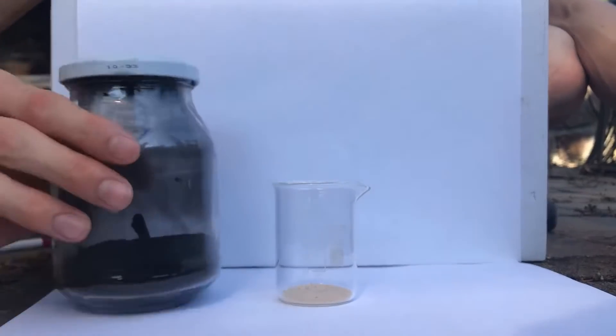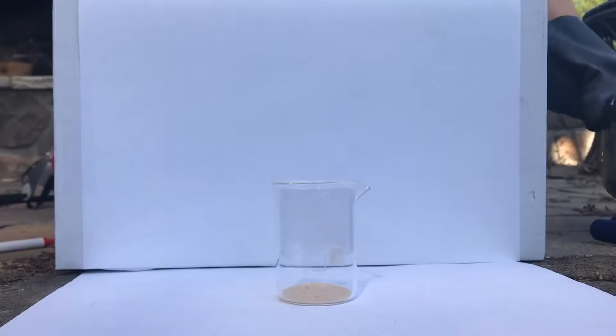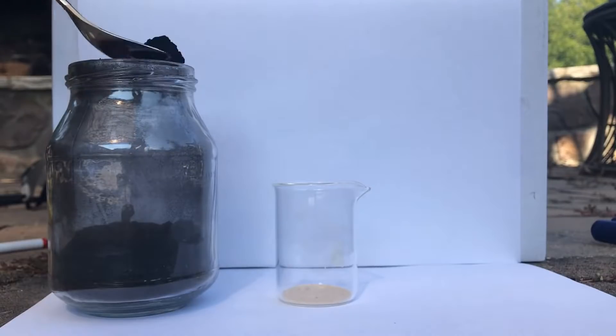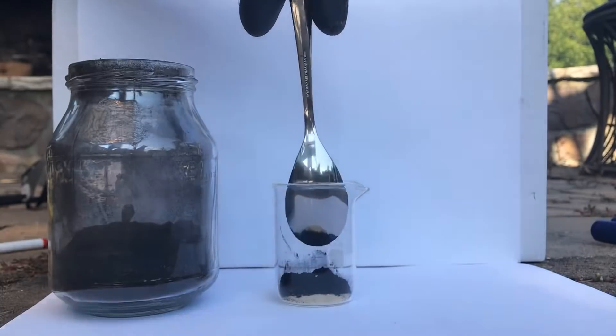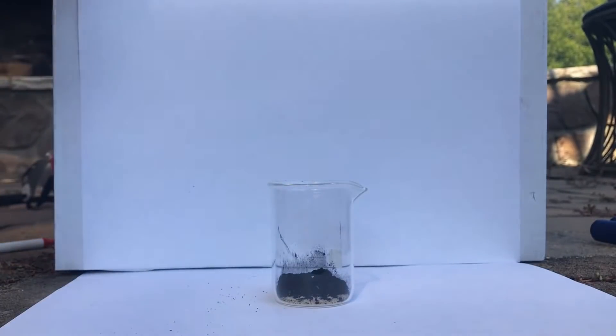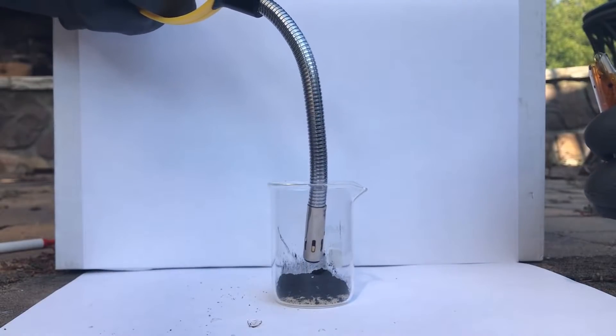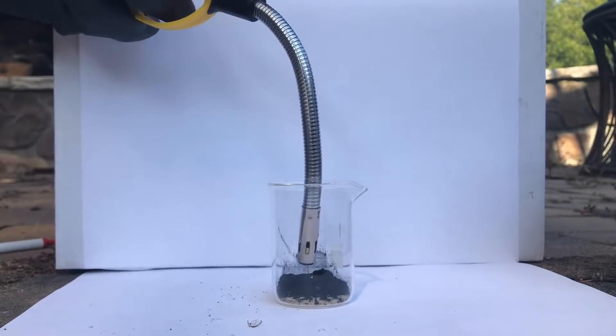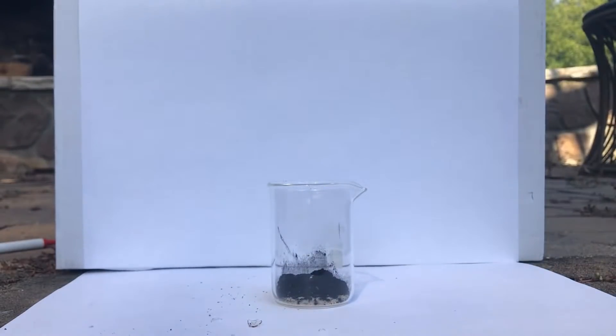Okay so now we're going to react charcoal or carbon with bromine. Okay so now we're going to first put in some charcoal. I'll put it on right there, putting a little bit more. Okay, let's go.